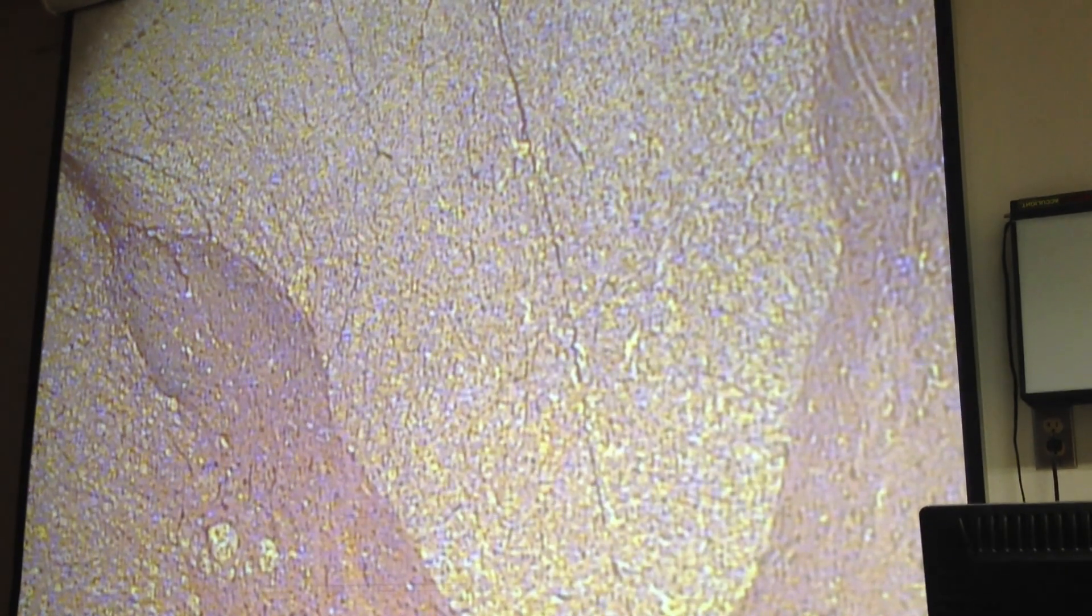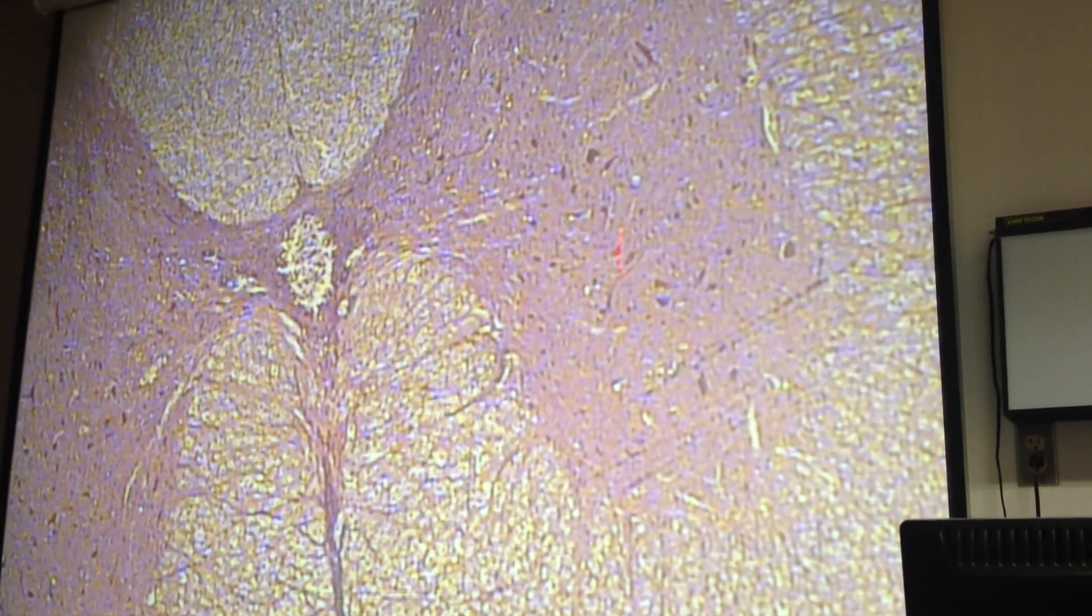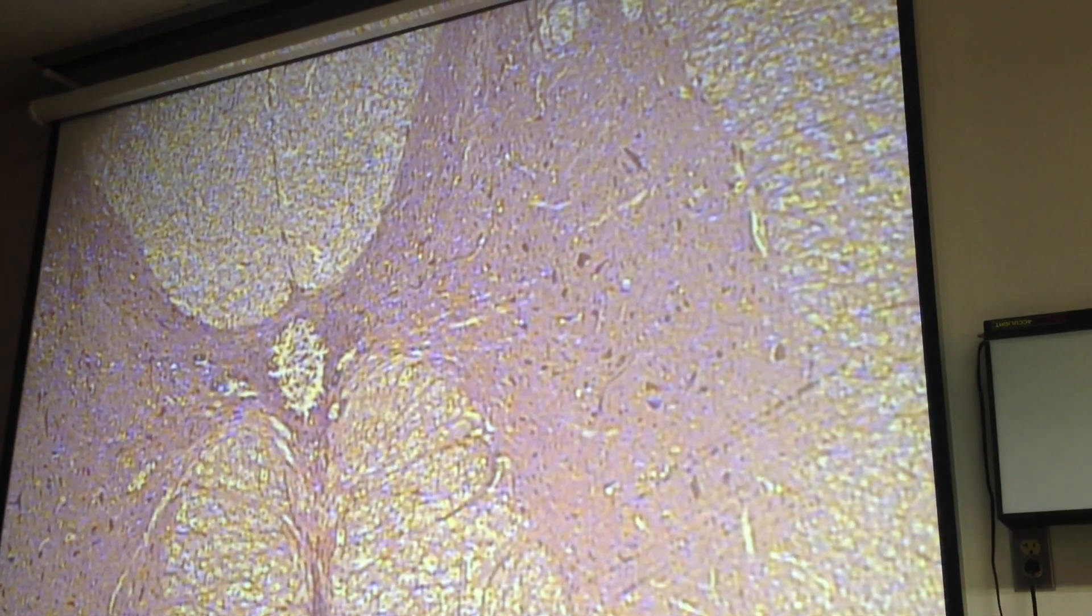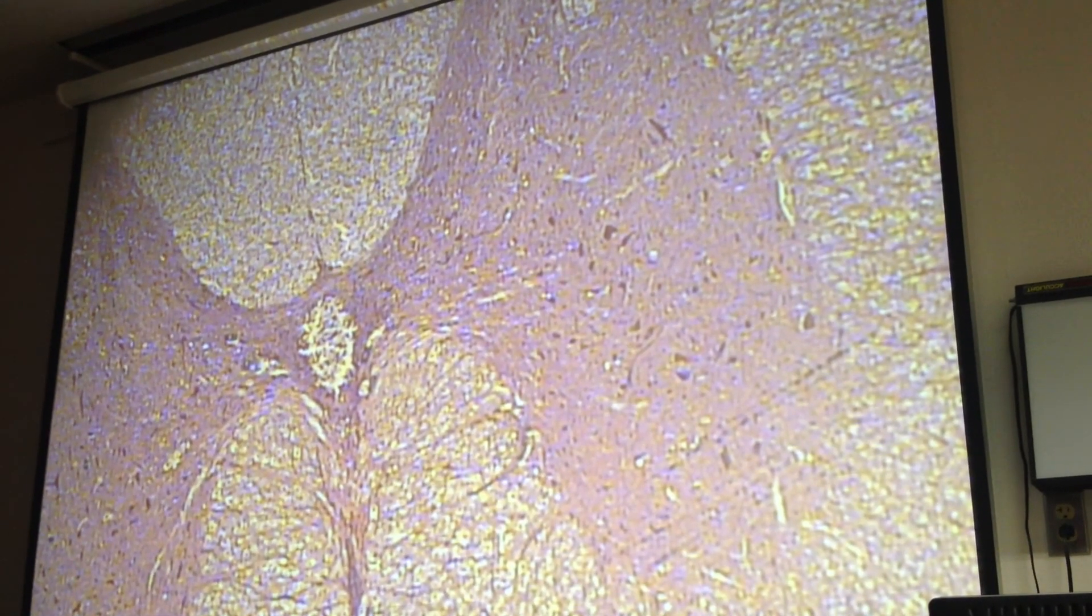Okay, let's look over here now. Is this gray matter or white matter? White matter. Good. And what's the dominant structure in there? Myelinated axons. Yeah. And then this is gray matter. And in here is lots of neuroglial cells, and what's the other dominant structure? Somas. Yeah. So lots of neuroglia and lots of somas. You may have just saw what looked like a web of stuff. That's the neuroglial cells along with it, and then the somas are in there too.